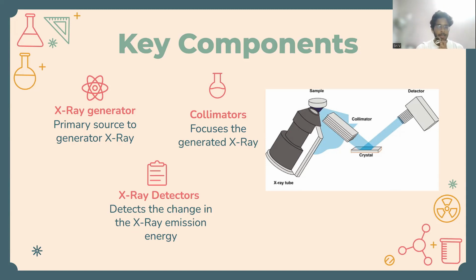Few tips are: radiation safety training should always be provided to the operators beforehand, and you should never aim the device at yourself or others when the primary beam, the X-ray lights, are illuminated. Also, we should remember to never hold the samples physically during analysis.